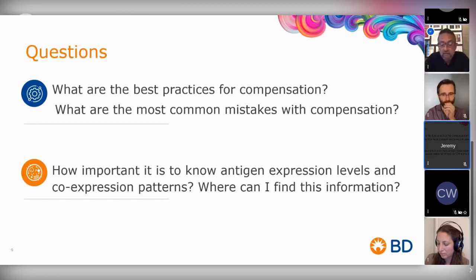That actually did a very good job of looking at CD1 through CD100 for human, on blood, on bone marrow, and also in thymus. And so it's an excellent resource to get the types of information for co-expressed receptors from 1 to 100, as well as the relative frequency on additional subsets of cells.